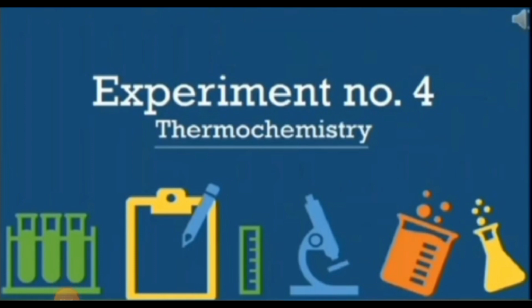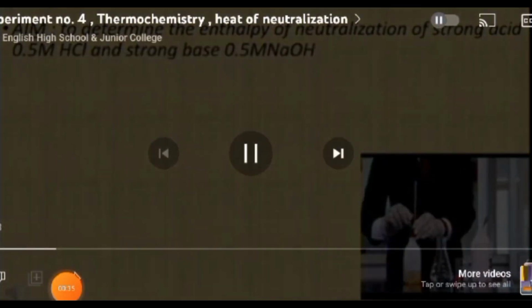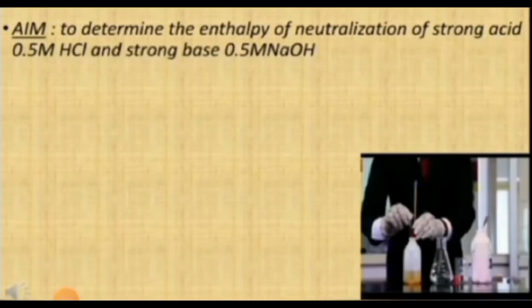Thermochemistry experiment. As we all know, in thermochemistry we study the measurement of the amount of heat evolved or absorbed. Our aim is the neutralization of a strong acid, that is 0.5 molar HCl, and a strong base, that is 0.5 molar NaOH.